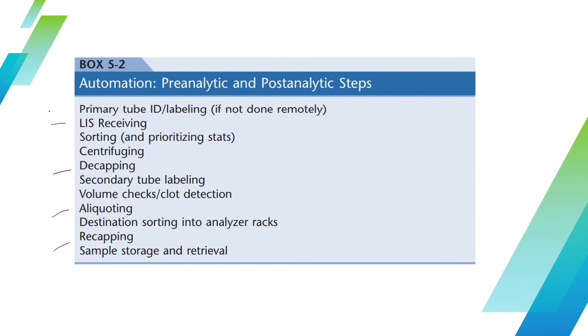In terms of receiving requests, errors are minimal, such as misreading a request. Even sending results, it is no longer necessary for you to deliver them to the nurse station. Everything is already programmed in the computer, and all you have to do is click and search and everything appears, which is very good and also environment friendly, since we no longer use paper.